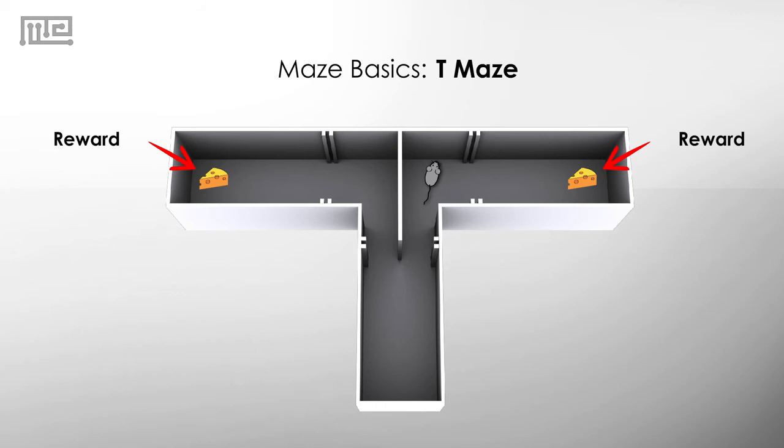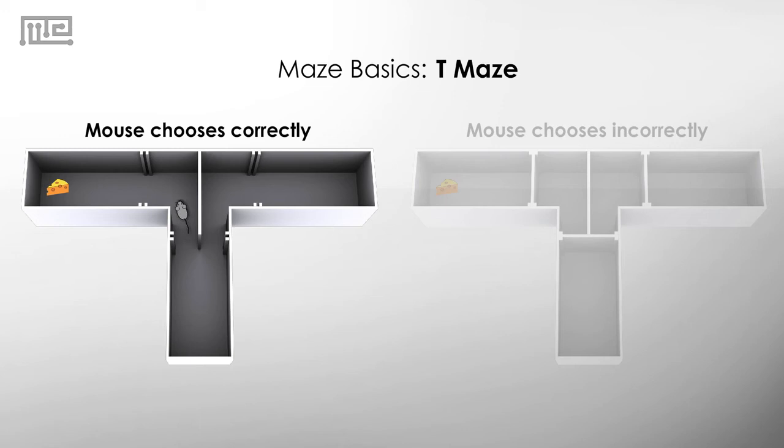The mouse starts and chooses an arm. Close the door to the chosen arm when it goes in to eat the reward and confine the animal there for 30 seconds.